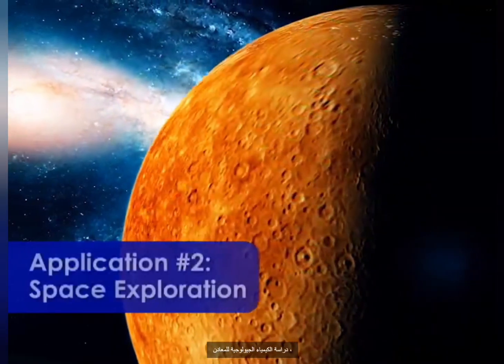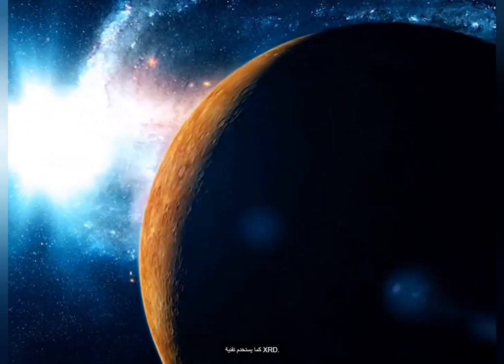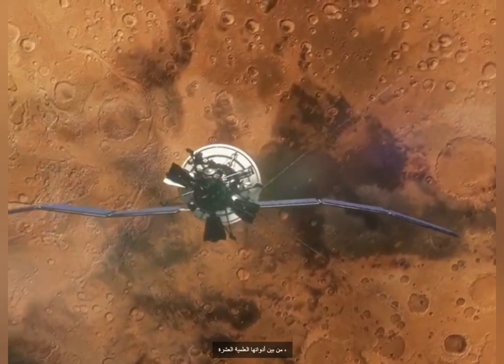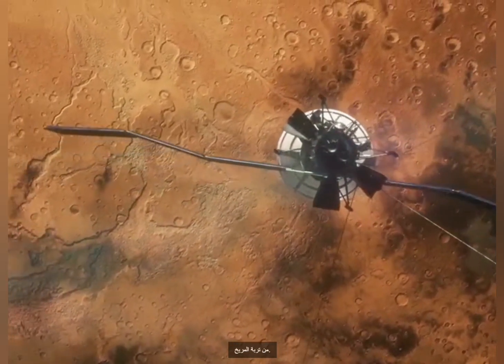The study of the geochemistry of minerals, either for mining purposes or even for planetary exploration, also makes use of XRD technique. Think of the rover Curiosity on Mars, that has amongst its 10 scientific instruments an XRD detector to analyze the composition of the Martian soil.